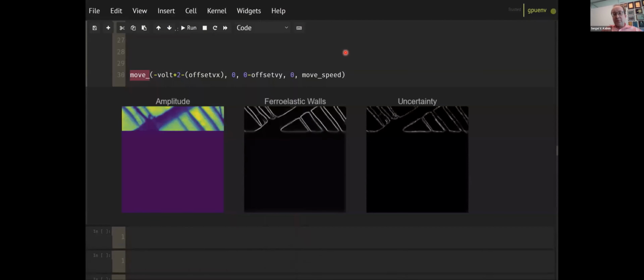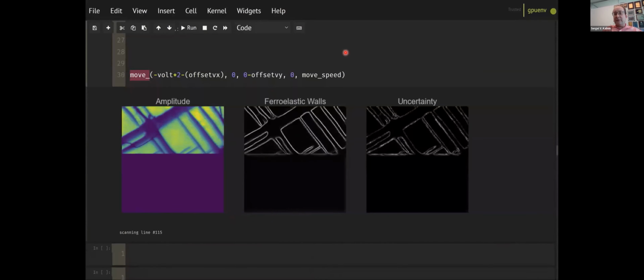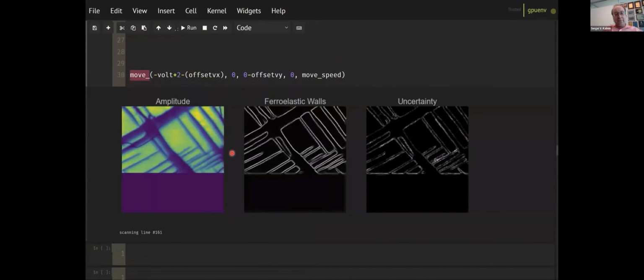So the simplest example of the experiment is the one where you know in advance what it is that you're interested in. And in those cases, machine learning works great. So this is the example of the ensemble network that works as a plugin for the scanning probe microscope. It reads the data streaming from the AFM detector, and it converts it into real-time semantically segmented data.